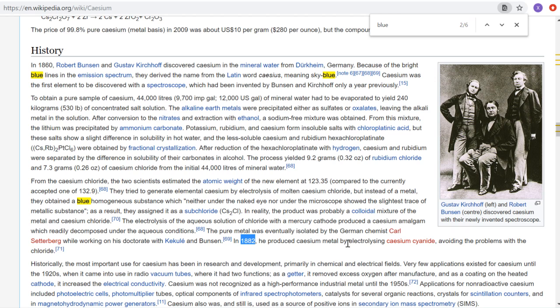And apparently they eventually got it to work using molten cesium cyanide, which melts much lower. But anyway, so this is a fascinating observation. Is it correct? So I decided I'm going to get some cesium chloride and electrolyze it, see what happens.